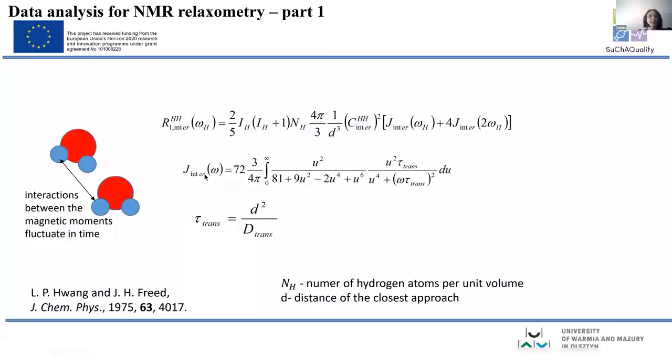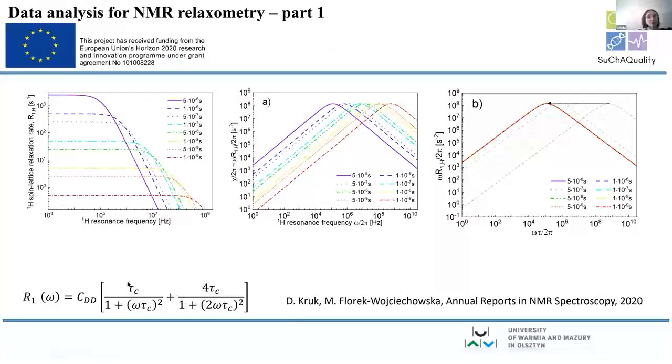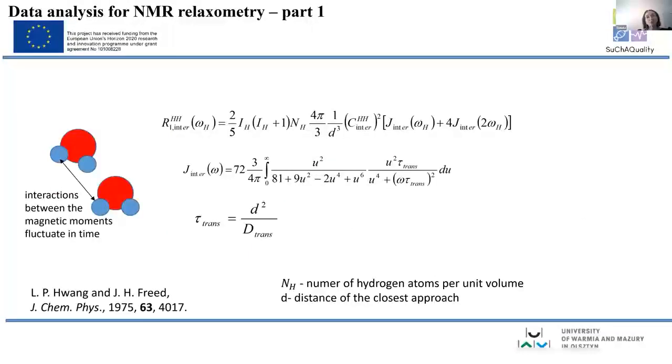There is a kind of integral here, and I know that it leads to a lot of difficulties. For instance, the typical question is, what is the U variable? Then I answer that this is a kind of integration variable. And of course, this thing is independent of U because of the integration from 0 to infinity, which causes some confusion. We'll have a talk separately about those expressions and we'll go step by step. I just want to tell you that such a thing does exist. It corresponds to translation motion. And you see, for instance, that if one would try to apply this kind of formula for real systems which perform translation dynamics, it would be a disaster.